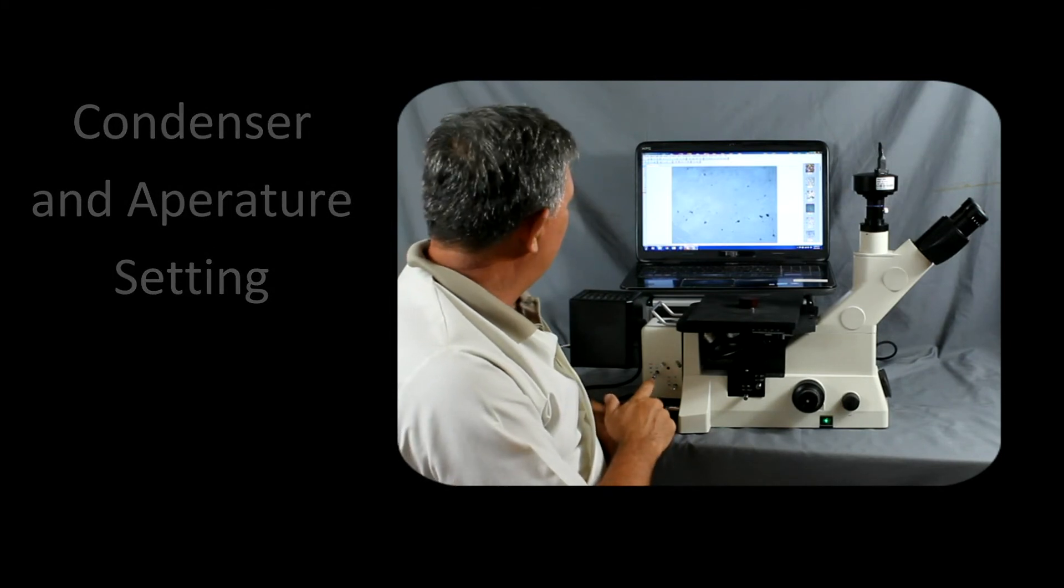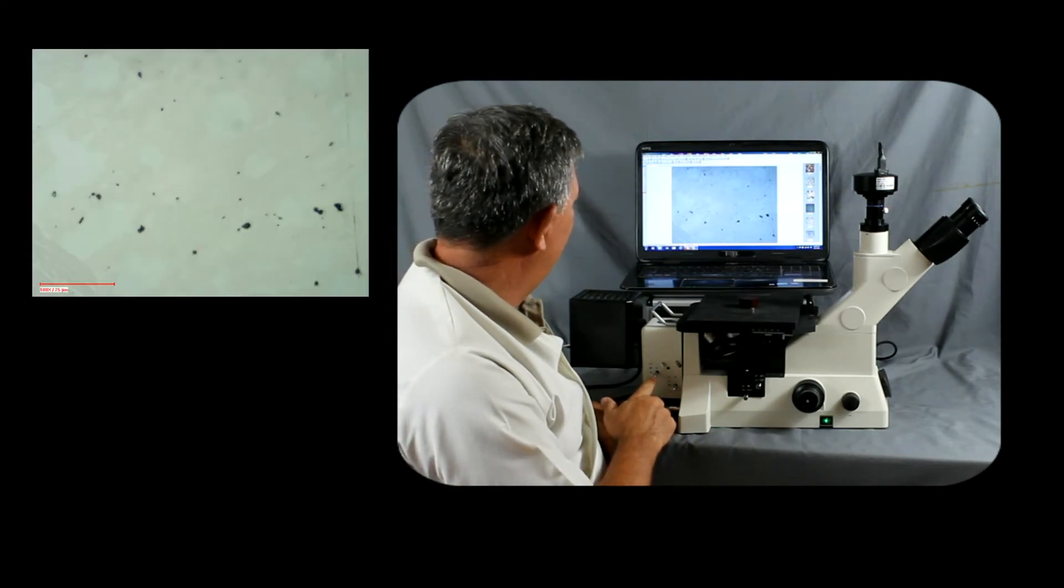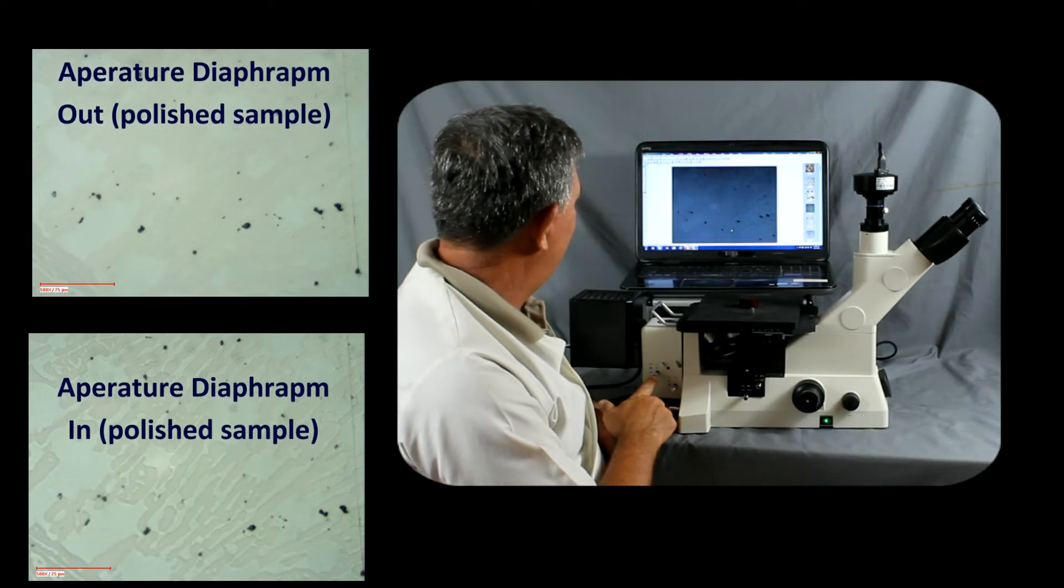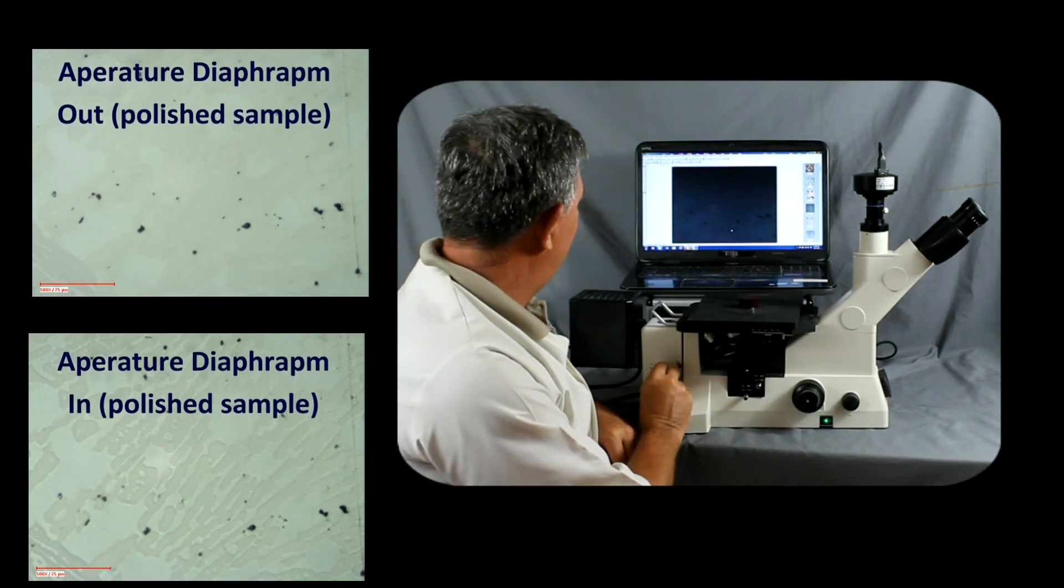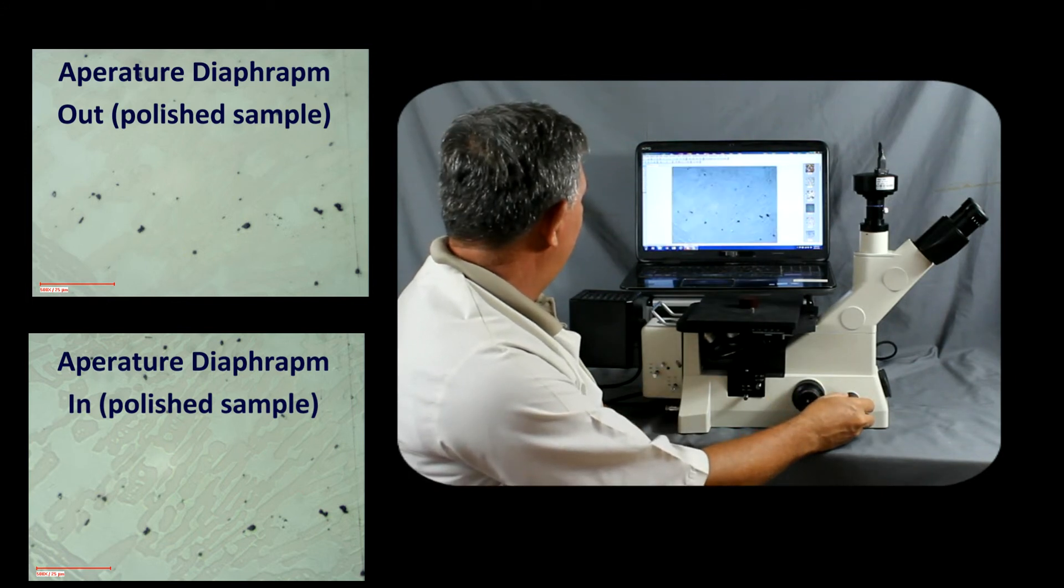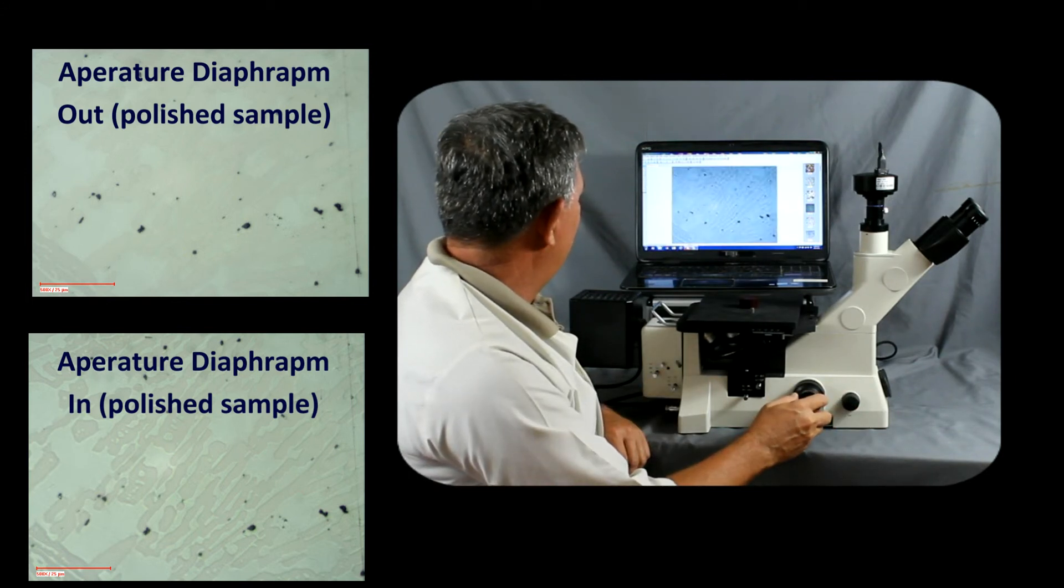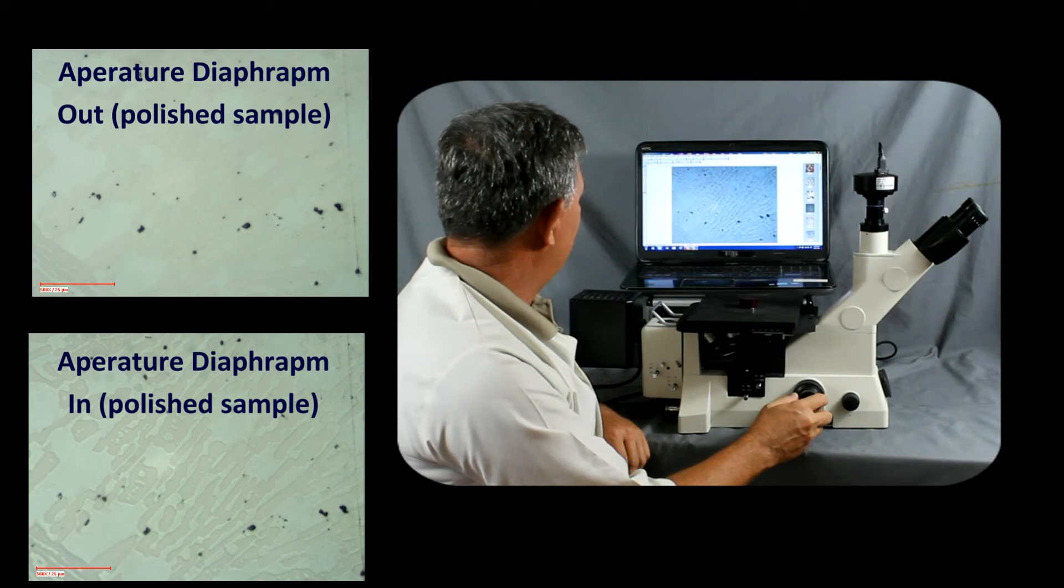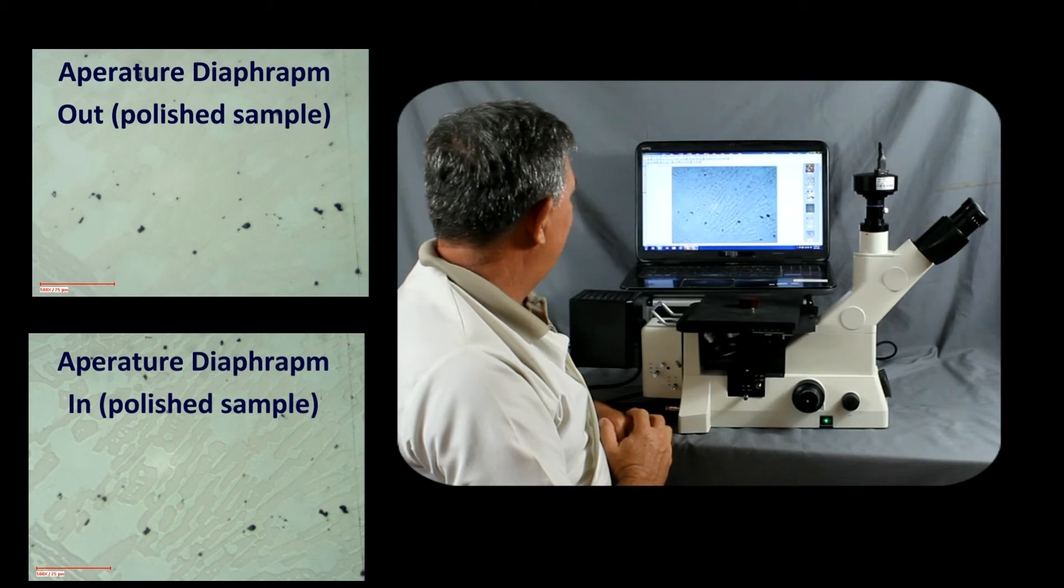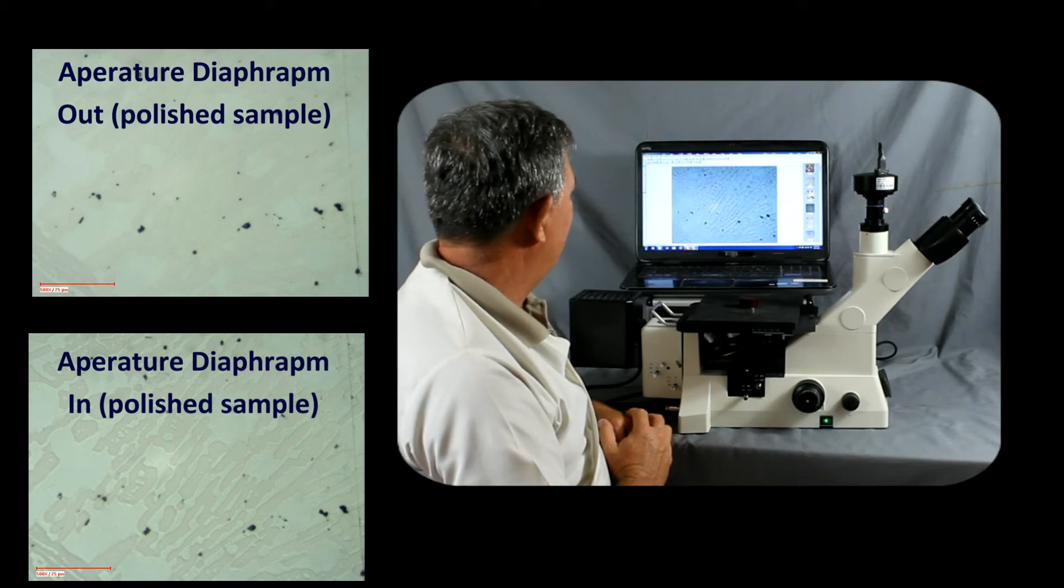The next thing we can do is we can adjust the aperture diaphragm to optimize the contrast. And you can see here that we actually are now bringing out features in the structure that we didn't see before. The aperture diaphragm is very useful for higher magnifications and increasing the contrast.